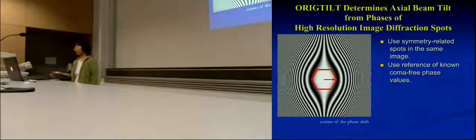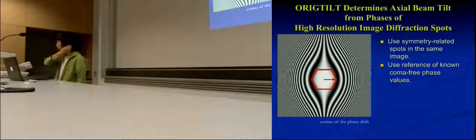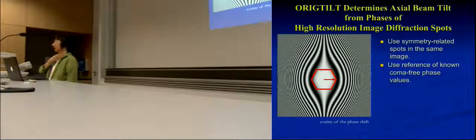Now that's the best situation. You have symmetry-related ones. If you don't have symmetry-related ones, it becomes a lot harder. If you have P1 symmetry, that's going to be harder to do. I don't think they have done this on ones without any symmetry. They've done this on ones that have some symmetry to start off.